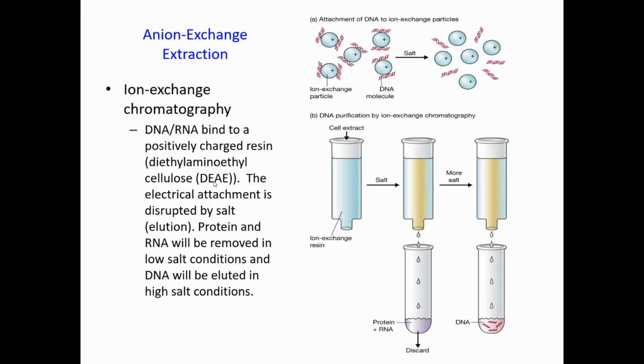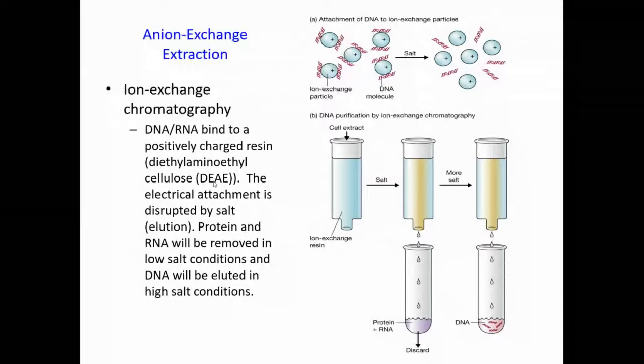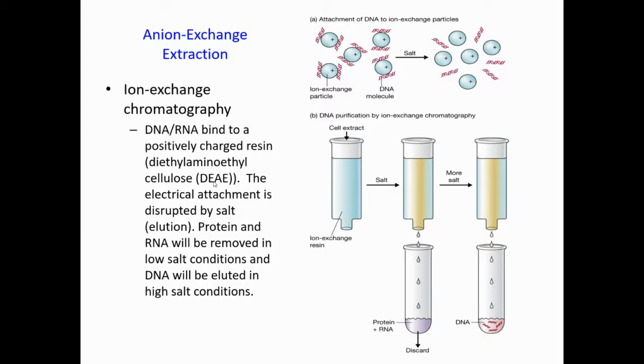And this is the anion exchange resin, okay? So you have defined silica beads with a large pore size, and then a hydrophilic surface coating and a high charge density. So with this ion exchange resin, the cell extract goes through it, then the DNA binds here, all right, and later on you can elute it.